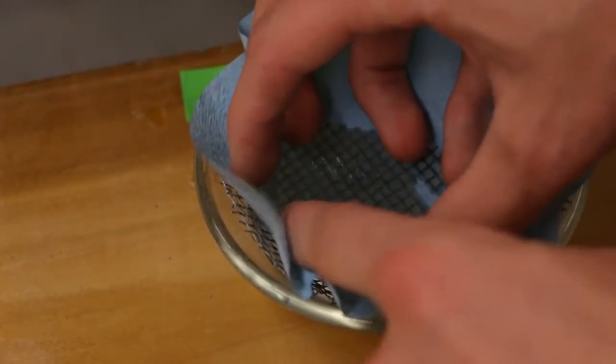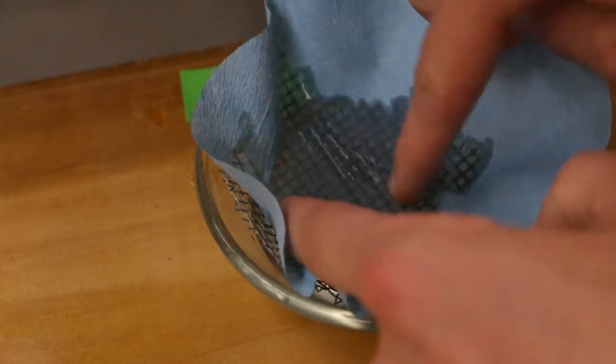When adding the filter paper, be sure there are no air bubbles or creases. The nematodes will have to crawl through this, but you don't want any loose soil getting through.